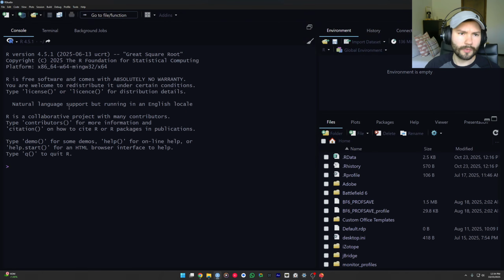And here we're prompted with the console, our little blinking cursor. First, we need to load the ForMAPL library, which we installed in the previous videos. We can simply type in library(ForMAPL), go ahead and press enter. This will load the library.